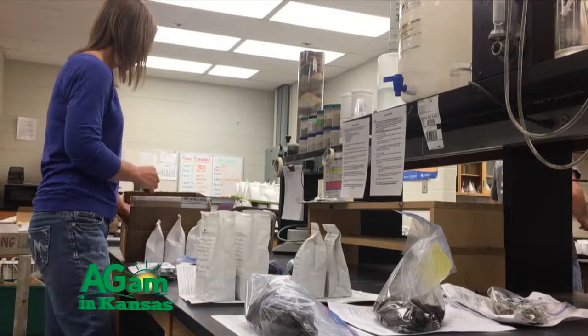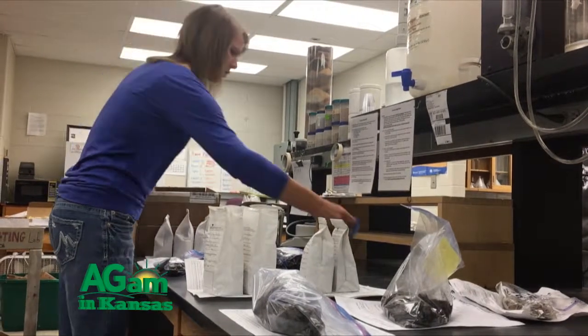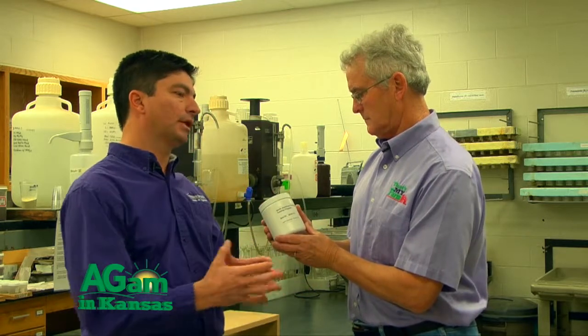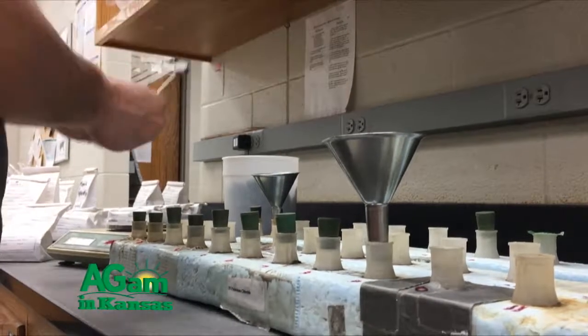Once the sample gets here in the lab, we do have a very strict protocol, steps that we follow, and our lab is certified with a national program, the North American Proficiency Test program. They send us some samples that we test several times a year, and they provide us feedback on how we are doing in terms of accuracy. So the variability in values here in the lab, chances are very low that we're going to have issues. Most of the time, it's anything that happens in the field and up to the point that the sample gets here. Okay. Thanks, Dorivar.